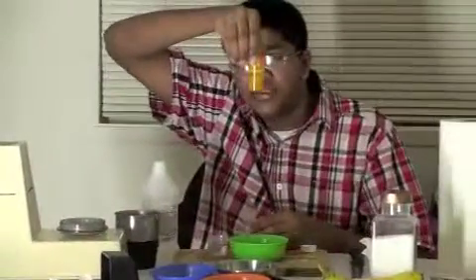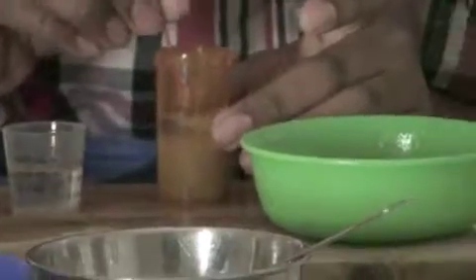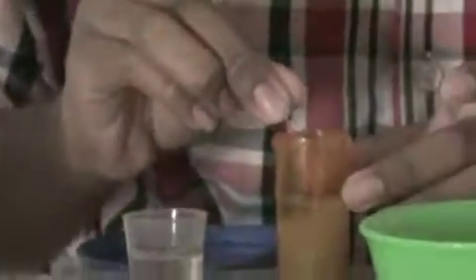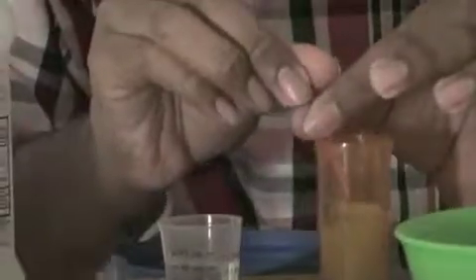So now, if you can see really closely, the DNA is suspended, while the banana juice is down here, and the DNA is suspended in the alcohol. You might not be able to smell this, but this smells really bad. So now, here comes in the toothpick. We're going to use the toothpick to get all the DNA out. So, you want to do a twisting motion, along with something close to pulling up. I can't get all of the DNA because there is a lot of it in this solution, but I'll show you a little bit of it.